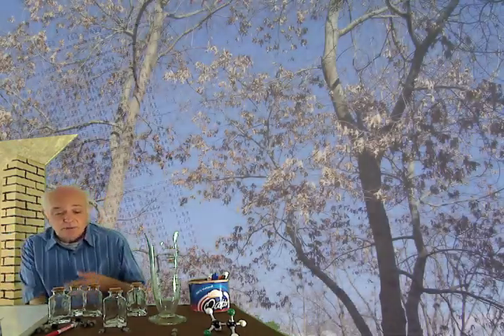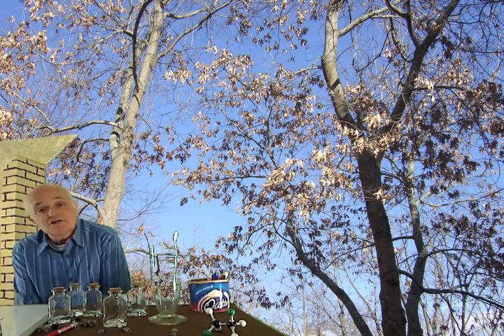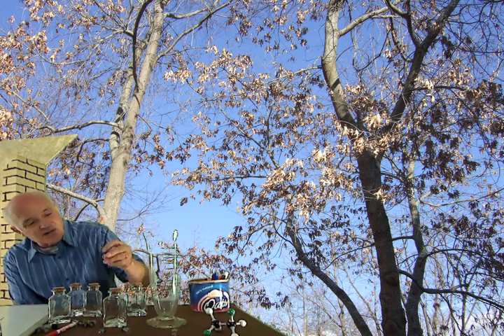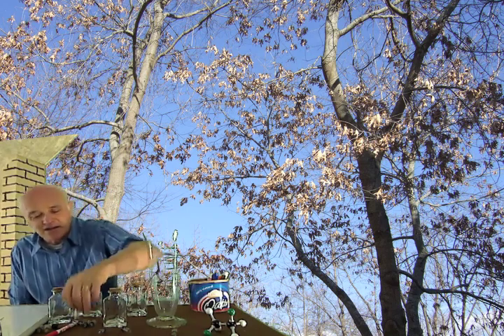So now to run the initial calibration, we simply run an injection of each of these five. And I know when I wasn't a very smart kid, I would be confused by this big jar and these little jars. I'd go, but wait a minute, this is a big jar and this is a small jar. It's 1 microliter of each, no matter what you do. So the size of it doesn't matter. Like I said, I wasn't a very smart kid. This is an approach which would work. I'd see no particular scientific reason why this approach wouldn't work. There are problems with it, and it is never actually done this way.